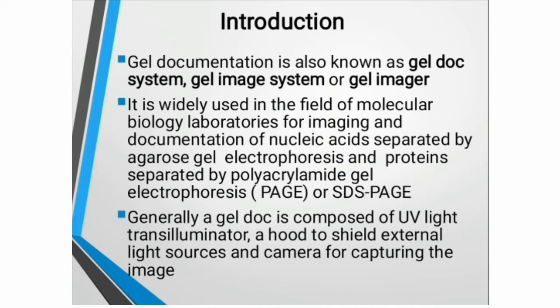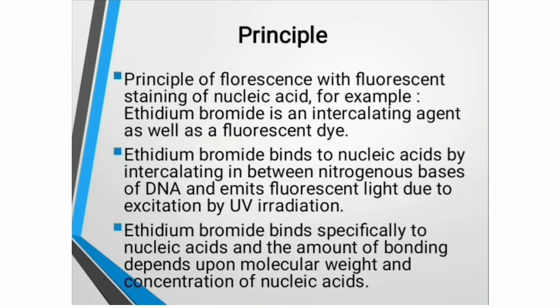Generally, a GelDoc is composed of a UV light transilluminator, a hood to shield external light sources, and a camera for capturing the image.